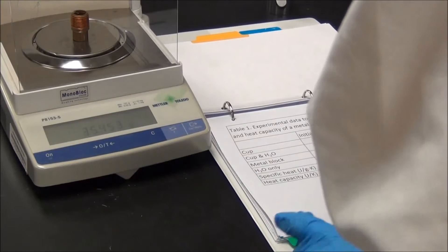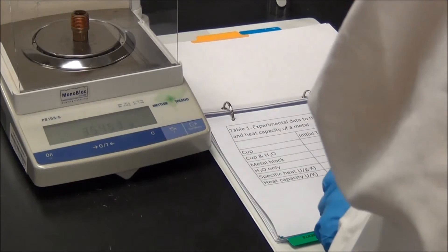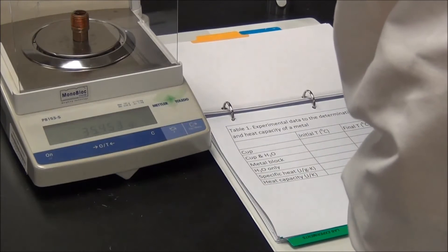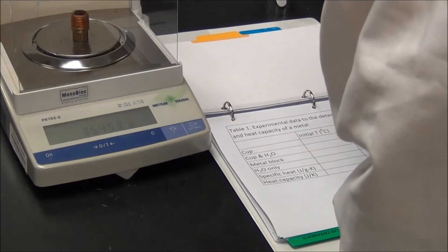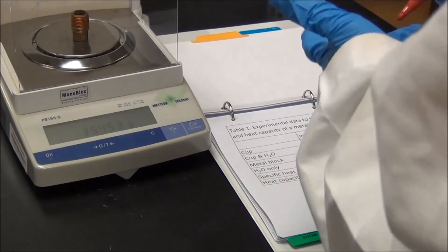And then we should record this data immediately after we get this reading in our notebook, not on a piece of paper. Make sure you write the data in the right place. 35.453 grams for the metal piece.